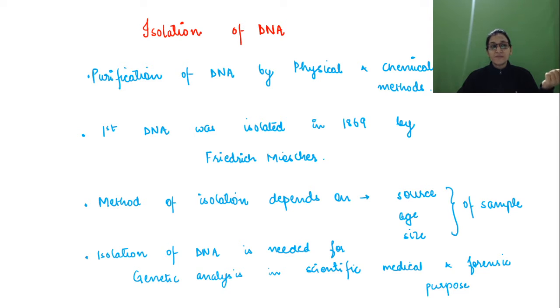Then the presence of various proteins, lipids, polysaccharides, and other organic and inorganic compounds in the sample interferes in isolating the DNA, because DNA is not kept somewhere safely that yes, this is DNA, go and pick it up.